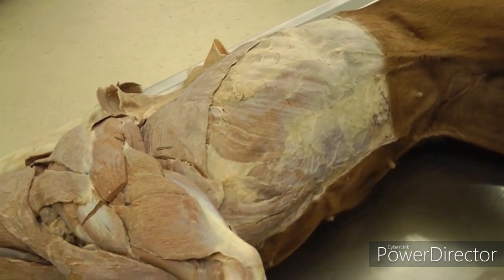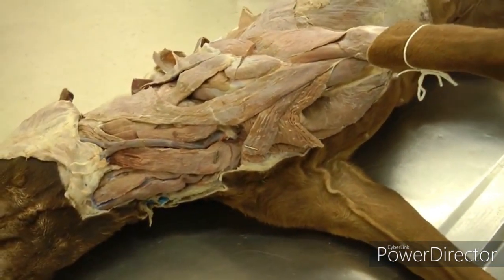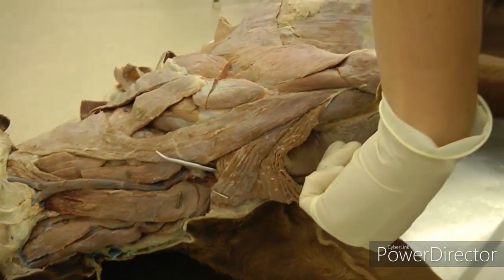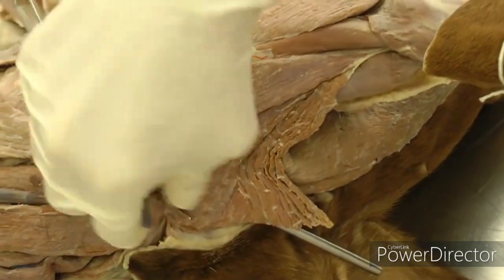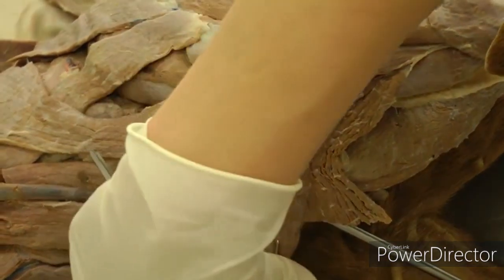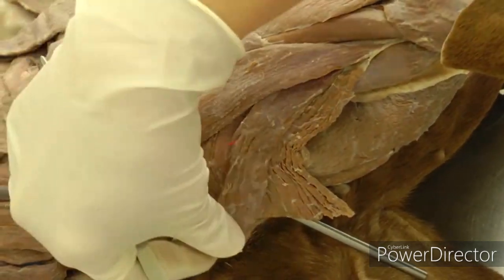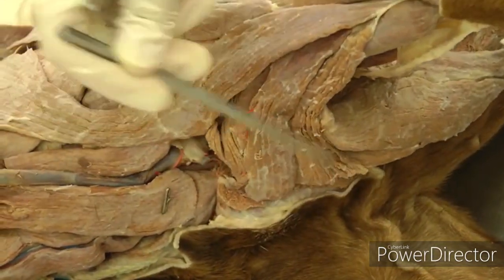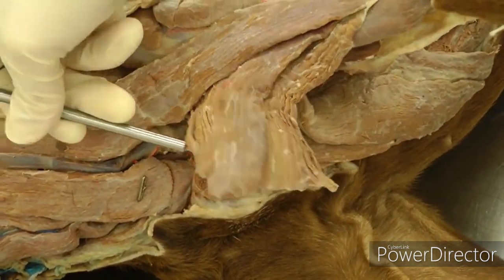Now look at your superficial and deep pectorals. The superficial pectorals are here — the probe is elevating both pieces. You have a descending portion, which is the strap going over the top, and a transverse portion — those two make up the superficial pectorals. Make a cut right next to the sternum, about a centimeter away, through both sections of the superficial pectorals, and reflect that up.